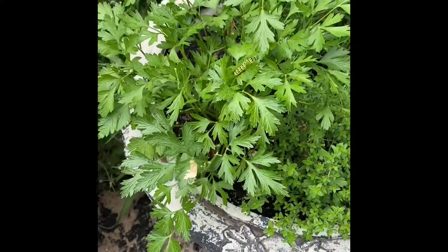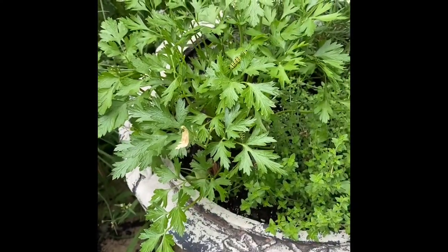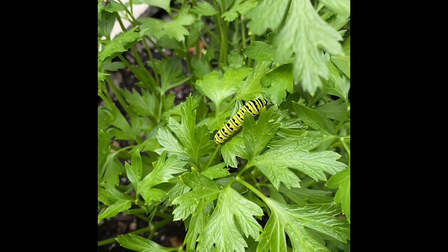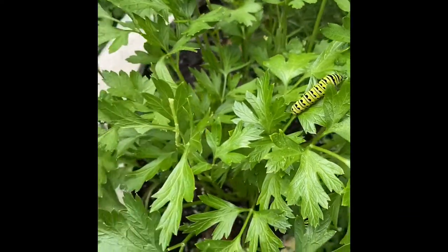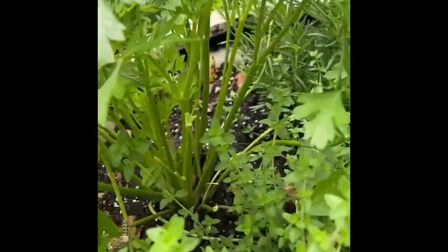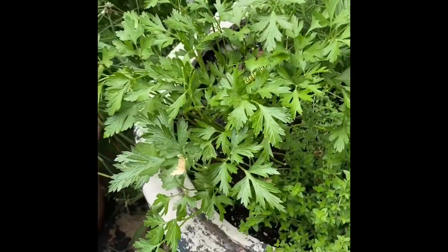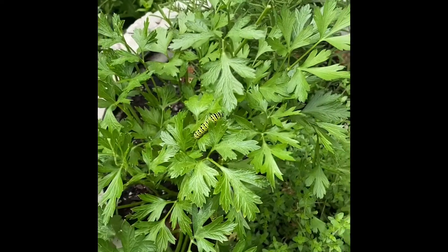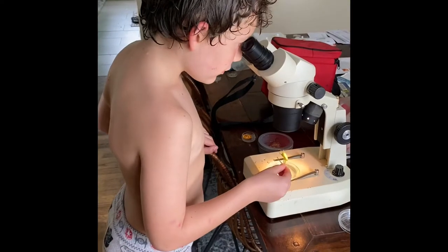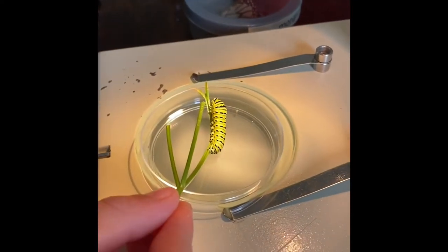Ben found these really cool caterpillars on our parsley plant, and we identified them with the help of the internet as black swallowtail butterfly caterpillars. We're gonna grab one of these little guys and check them out on a really cool piece of scientific equipment called a stereo microscope. It's a black swallowtail caterpillar and it looks very similar to a monarch caterpillar.